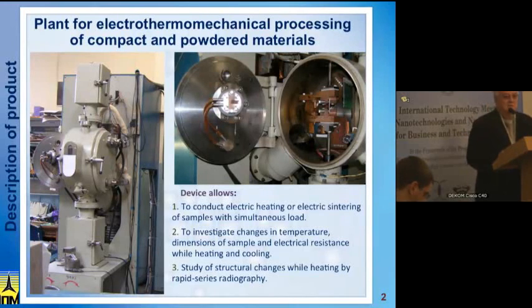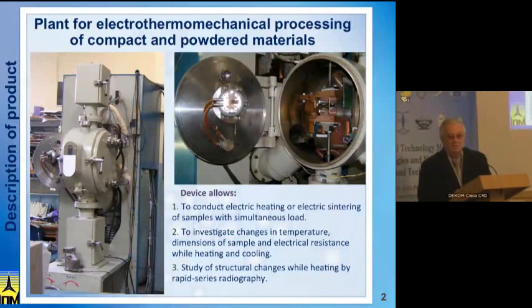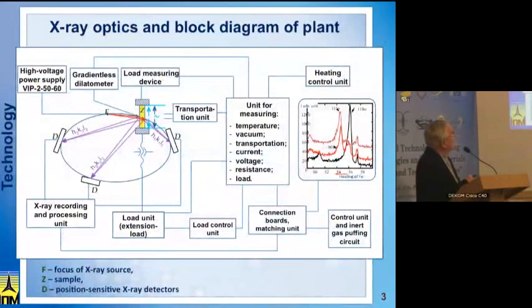When we talk about exposure, the standard equipment uses exposure where the slit with the detector is located next to the sample or within the interference maximum distance. In this case, okay, this is a schematic that shows huge potential capabilities of this equipment.